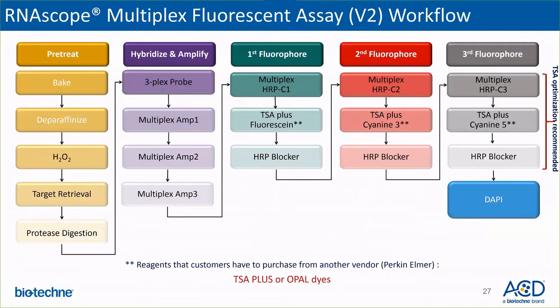This schematic shown here uses fluorescein, Cy3, and Cy5 in the C1, C2, and C3 respectively, but these may be mixed and matched as per your preference.